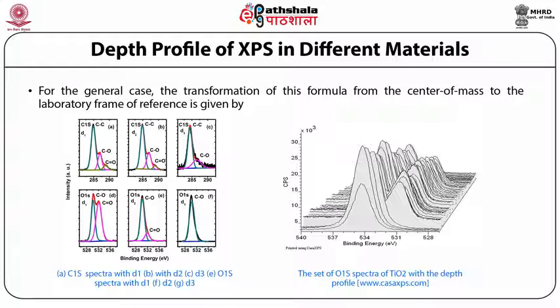The objective of the experiment is to observe the trend in the elemental quantification values as a function of etch time. The actual depth for each XPS analysis is dependent on the etch rate of the material being etched by the ion gun at any given depth.